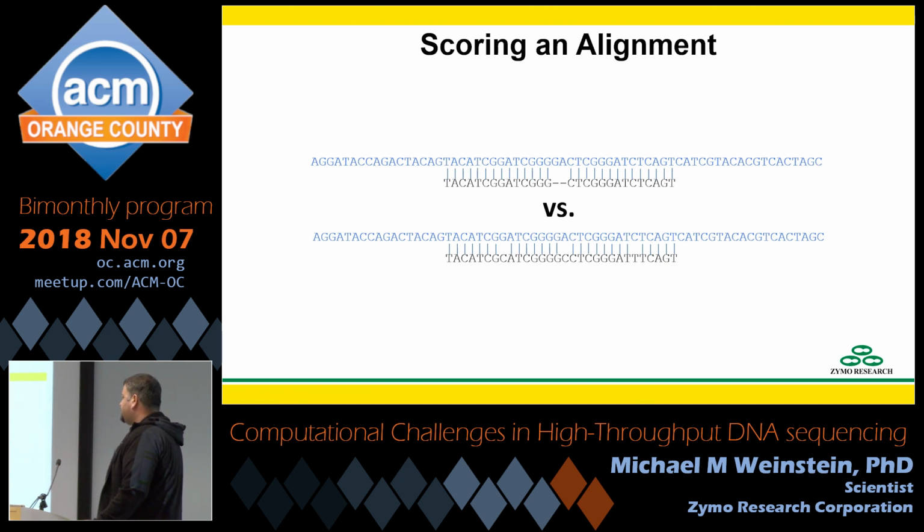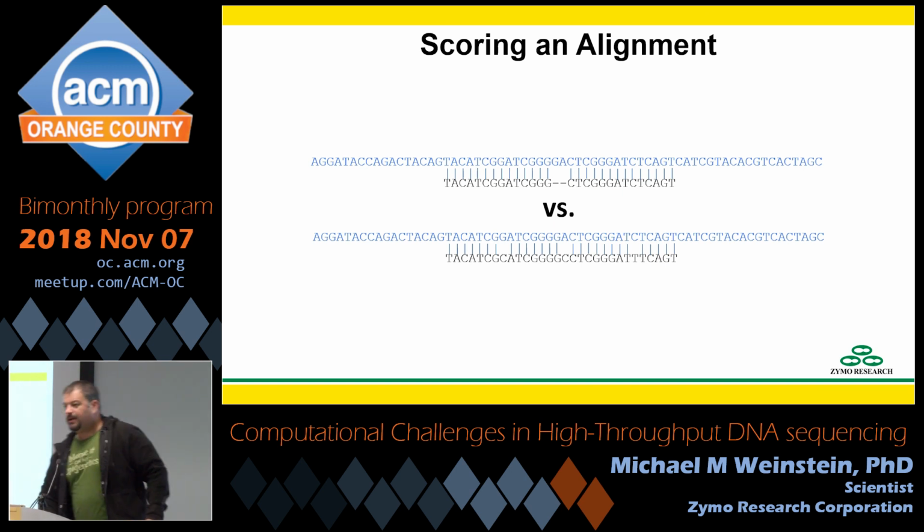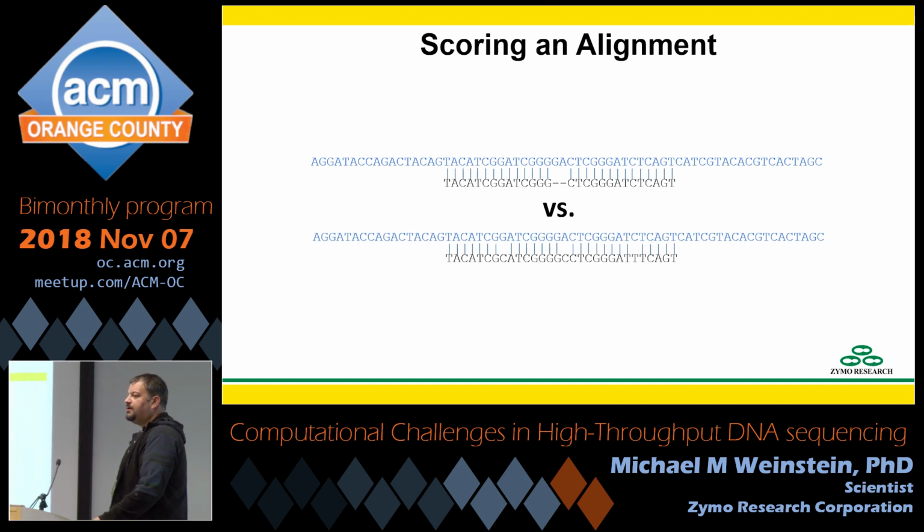You're also probably going to want to look at the confidences behind them. So maybe those 3 mismatches are low confidence, in which case you can say, yeah, there's 3 bases that don't match, and they're actually bad confidence calls. The other thing is, typically for confidence scores, any insertions or deletions are going to give you a big hit to your confidence score. And there's a good reason for this. If I didn't take a big hit to my confidence score every time I tried to open an indel, I could align anything anywhere. Because I could just put in enough insertions and deletions that anything could go anywhere.